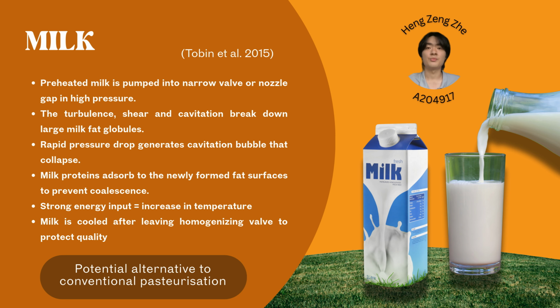This combination of droplet disruption and heating can partly denature whey proteins and inactivate some microorganisms, so that under suitable pressure and temperature combination, HPH can potentially function as both conventional pasteurization and homogenization for drinking milk, although the very high interfacial area can also make the product more susceptible to lipid oxidation and off flavors if not carefully controlled.